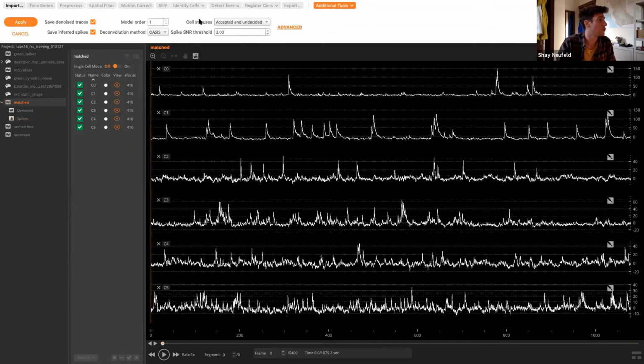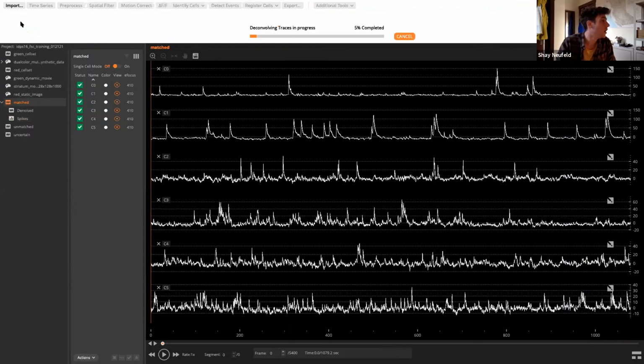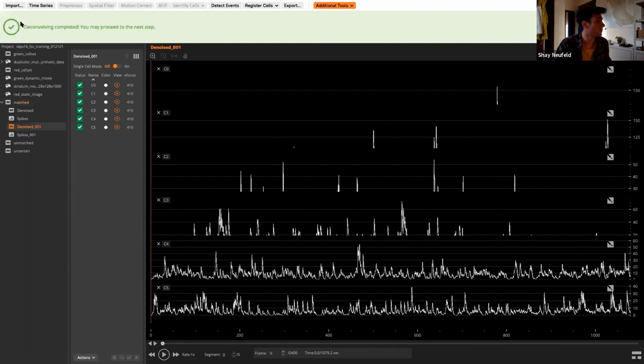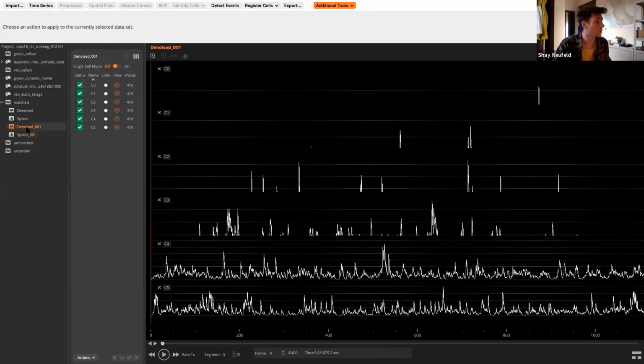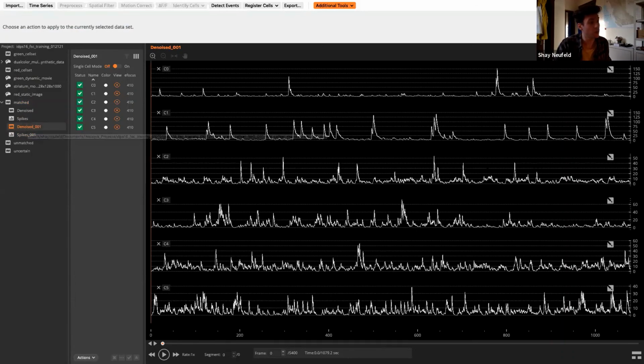We can try now. I'll try really fast, but if it takes too much longer, then I'll let it go. Looks like it might not take too long. Okay, didn't make too much of a difference here, actually. So this might be the limit, and it might also just be because this is truly bad data, and so it's not able to model this data very well with an autoregressive model, and so we're not recovering great clean spikes. Up here, you can see these guys are much cleaner, and those probably represent higher quality cells.